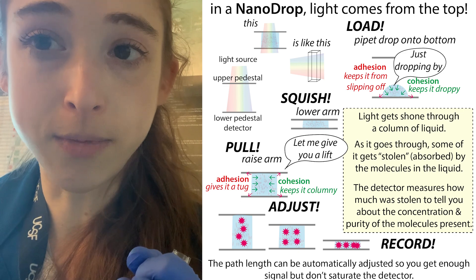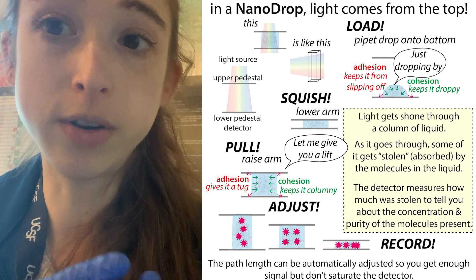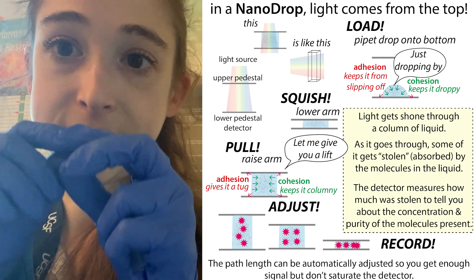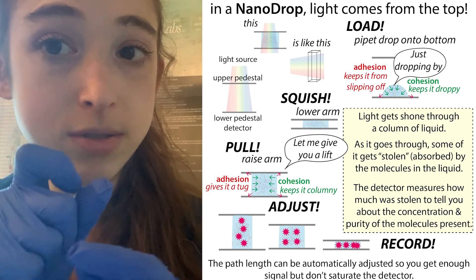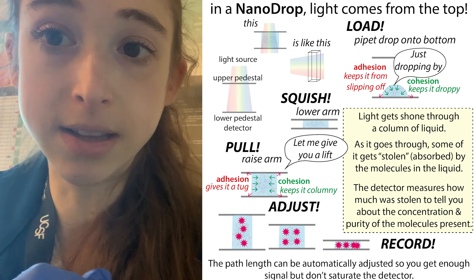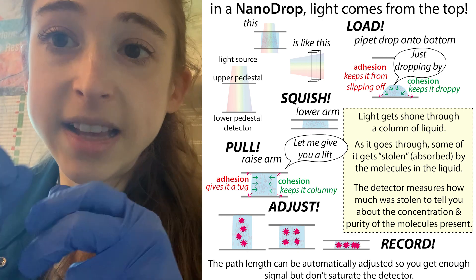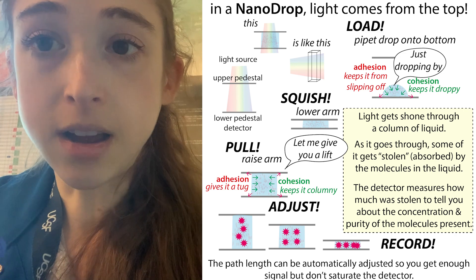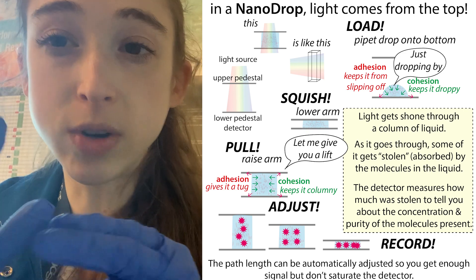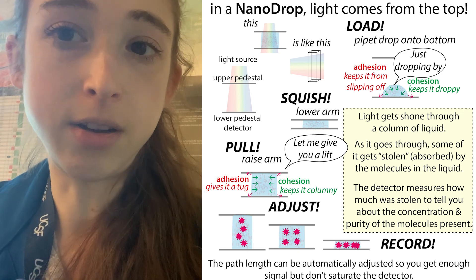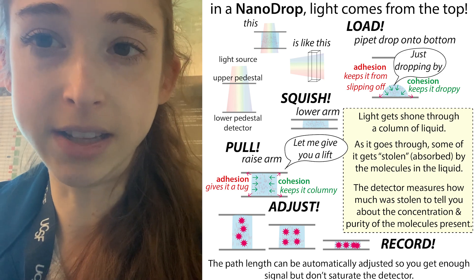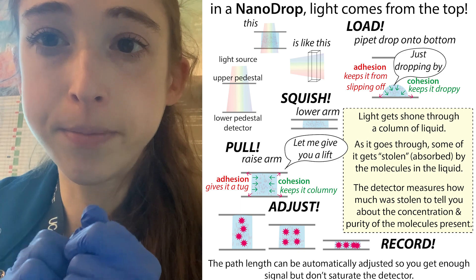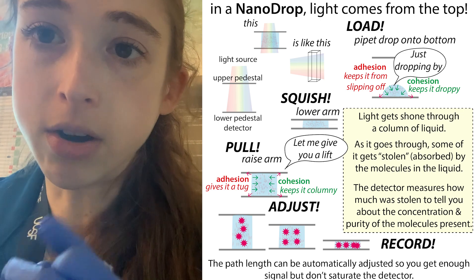One thing that can happen is that the column might not form very well. This can happen if you don't have enough liquid, or if your liquid contains surfactants or surface-acting agents - things like detergents that interrupt the water-water interactions you need to form that column. Also, if you have a lot of protein in your sample it can make column formation harder because it disrupts those water interactions. One way to help with protein samples is to pipette a bit more - typically you use one to two microliters, but with protein I try to use one and a half to two microliters. With DNA or RNA, you have less of this problem so a lower amount works fine.